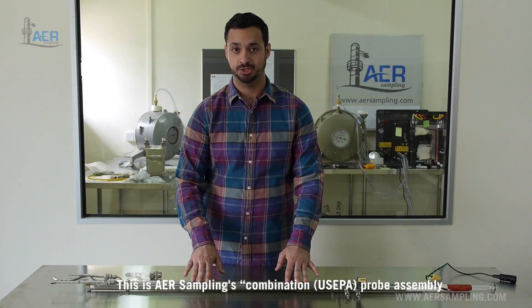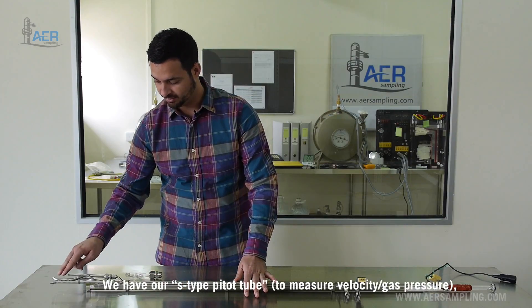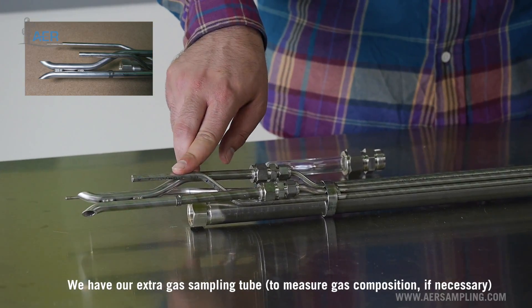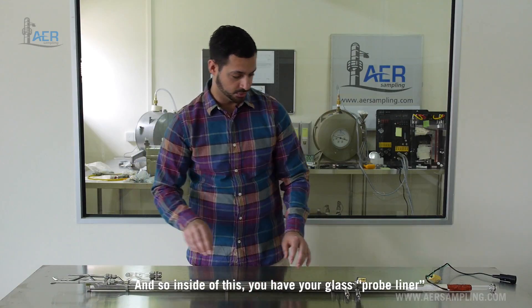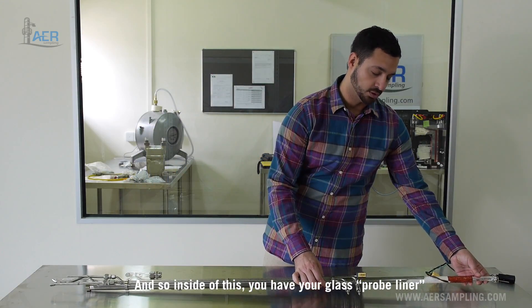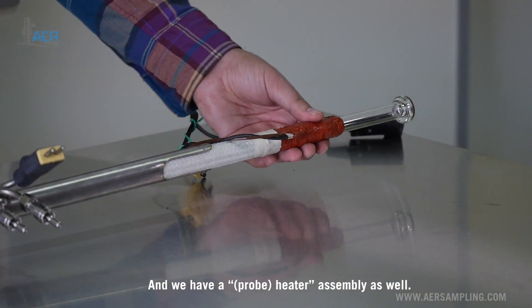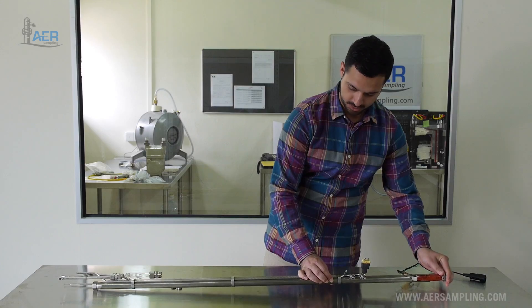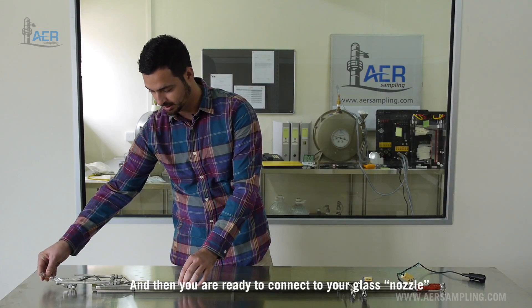This is AER sampling's combination probe assembly. It's stainless steel 316. We have our S-type pitot tubes, we have our extra gas sampling tube, and we have our thermocouple. Inside of this you have your glass probe liner and we have a heater assembly as well. These just slide right in together, and then you're ready to connect to your glass nozzle on this end.